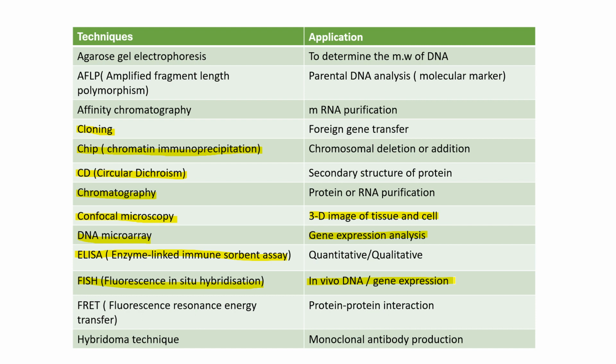Okay. Then FRET, fluorescence resonance energy transfer. By this technique, we can identify and analyze protein protein interaction.